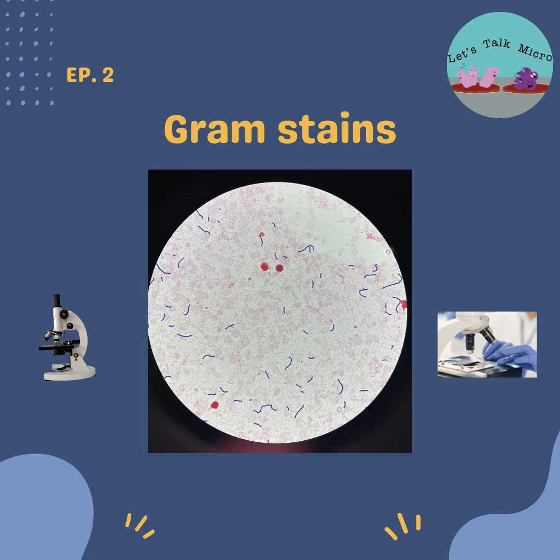So just to put a visual on it, you're looking at a blood plate, you see some white colonies. You don't see anything growing on MacConkey. So you say, okay, it is a gram positive, right? MacConkey is selective for gram negative rods. So you decide it is growing on blood, it is white, it's coag negative. And I have seen techs take this to the next level. For those of you that are familiar with the Vitek instrument, once again, Vitek is not paying me to say this.